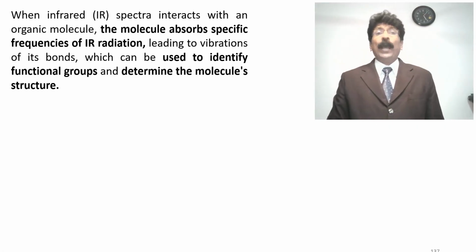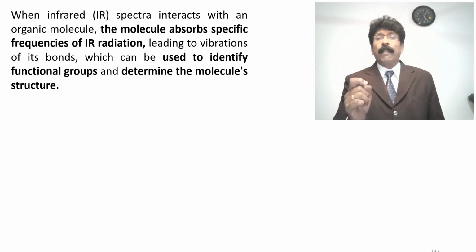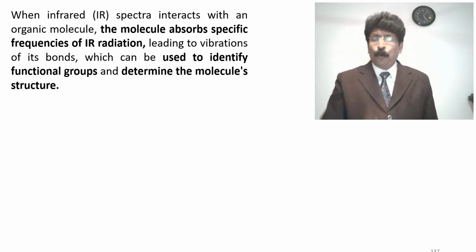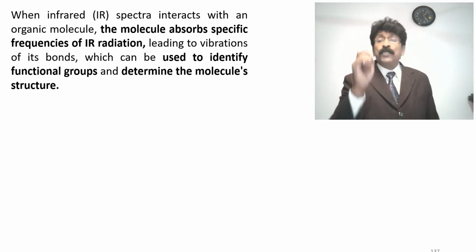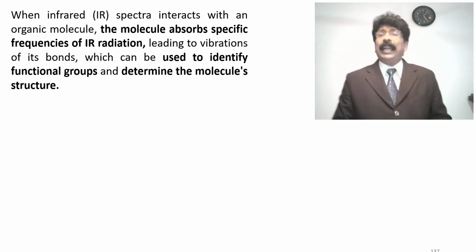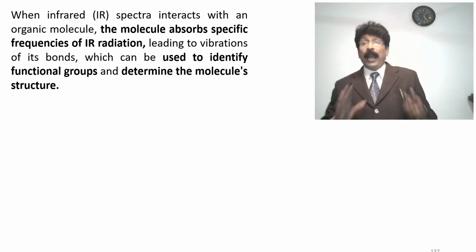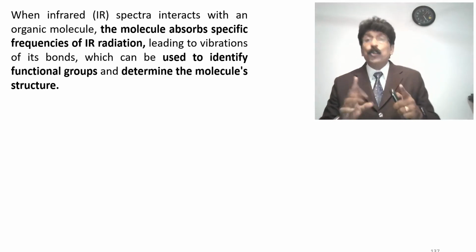When infrared (IR) radiation interacts with an organic molecule, the molecule absorbs specific frequencies of IR radiation, leading to vibration of its bonds.